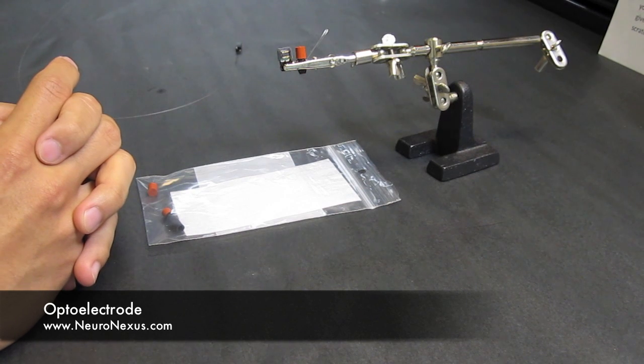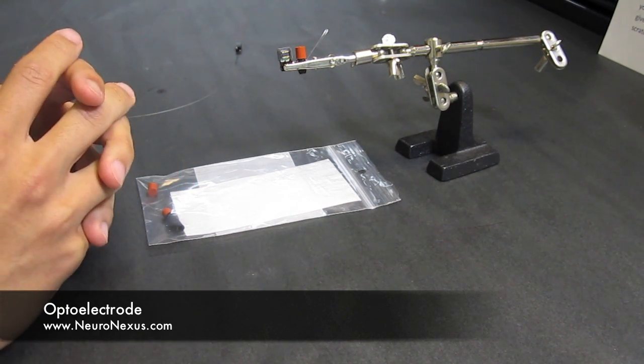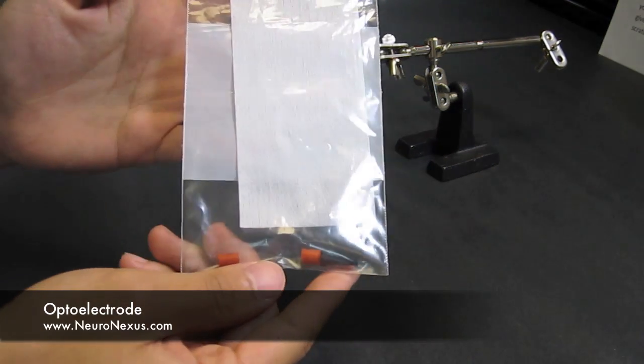Regardless of the kind of coupler you have, keeping the ferrules covered and clean is really important. We provide a spare cap and some cleaning wipes as extras in your order.